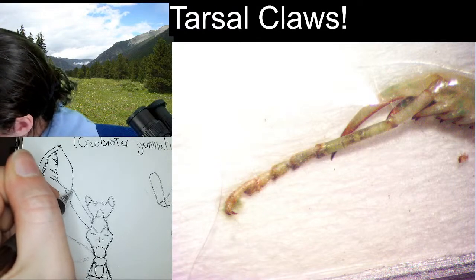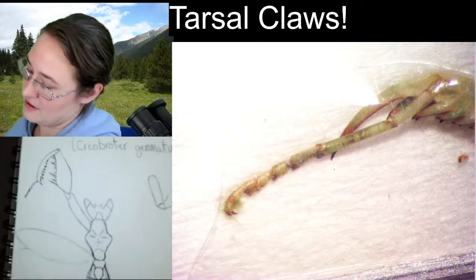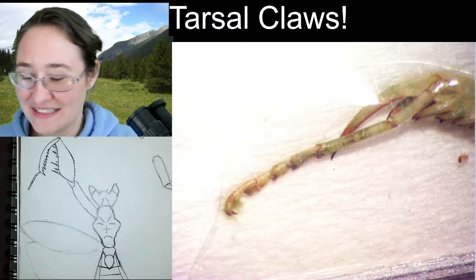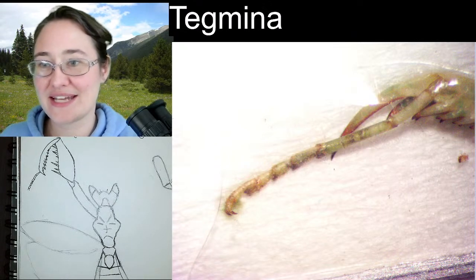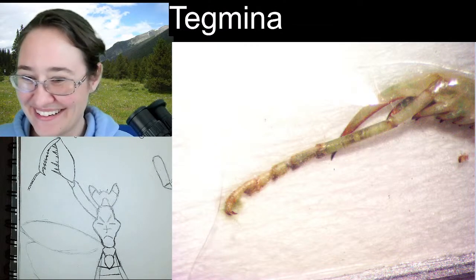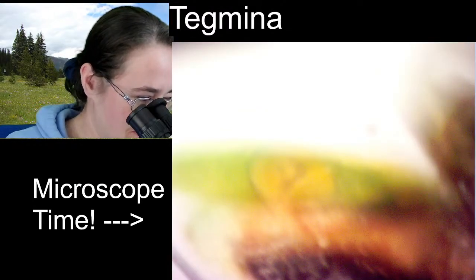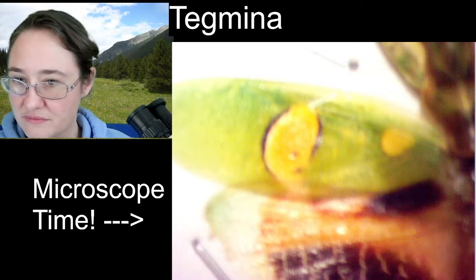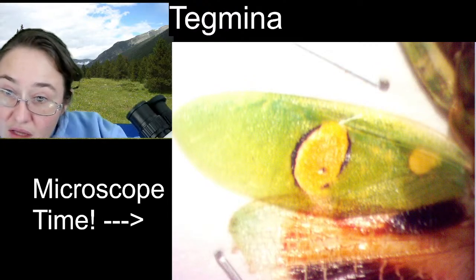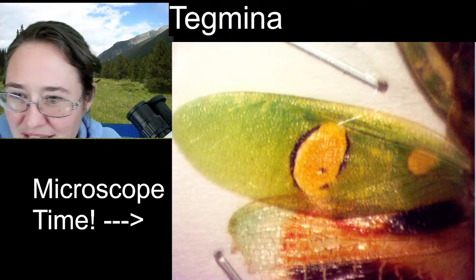Awesome. Alright, so that is our front leg. We did it, guys! I'm proud of us. Alright, now we're going to go on to the tegmina. Oh, yay! Good! I'm glad you were able to make it this time. Darken it just a little bit so we can see the end a little better.